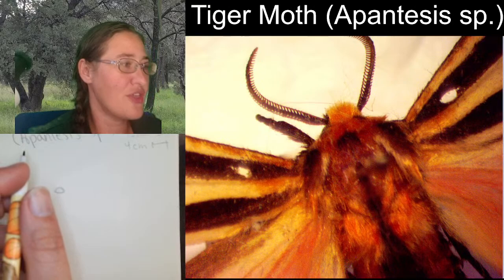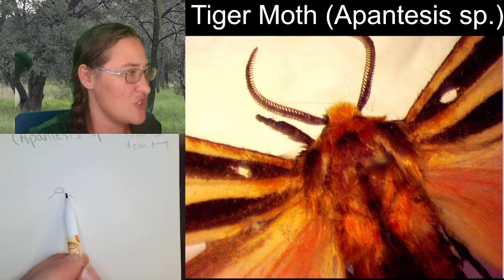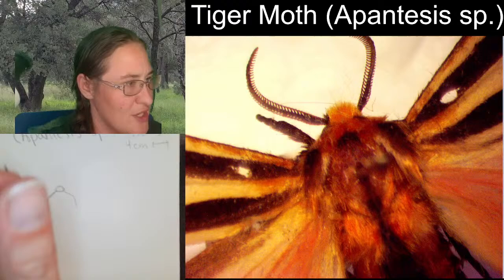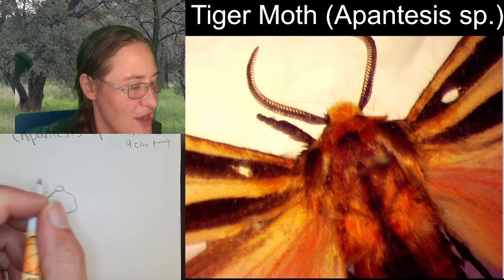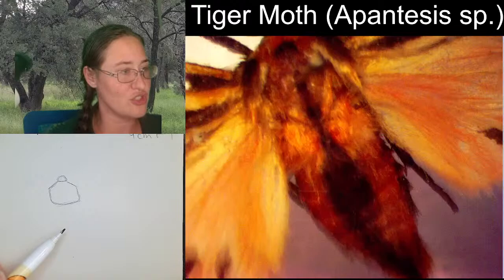Very good. So the width of the thorax is looking like about three times the width of the head. If you go out from the edge of the head, equivalent to its length on both sides, then you will end up with what we want the thorax's width to be. I'm just going to create this shape here. I'm just creating the thorax, and we are going to make minor modifications to this, but I'm just going to cut it straight across for now, and then we'll talk about how that's going to change in the future. This is where the wings are connected. And then, if I scooch the specimen up, there we are. We end up with the abdomen.